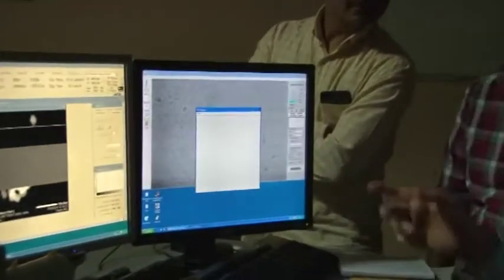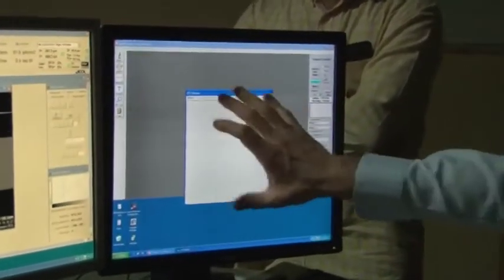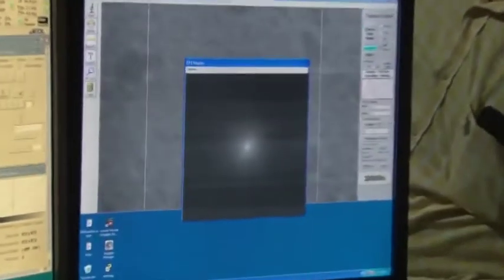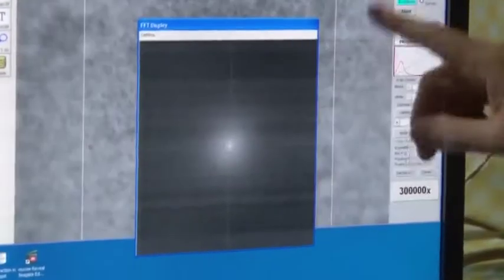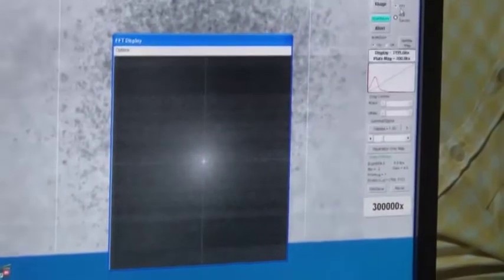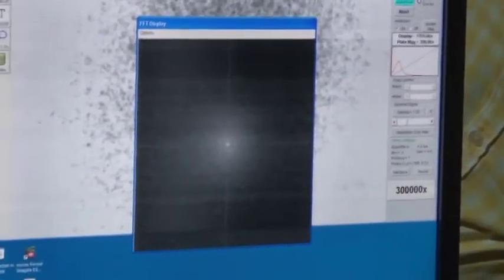If you use the Fourier transform, which is just calculated from all the recorded images, what you see is the recorded image, and it's just integrated. Don't mind that. We were told that you cannot record both simultaneously.